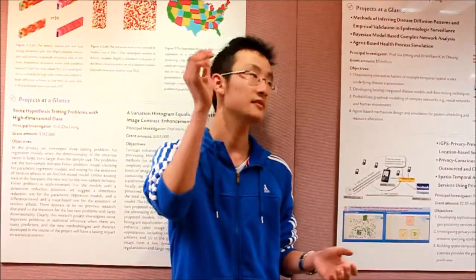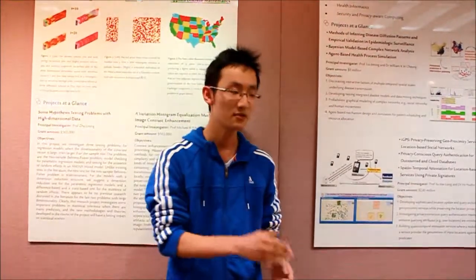Think of this. If I toss this coin with a certain amount of kinetic energy, like this, it will fly right there. But if I have a very heavy book in my hand, and I toss it with the same amount of kinetic energy, you could imagine that it will fall out of the sky dead. And that's basically how mass spectrometry works, by distinguishing the difference between the two.